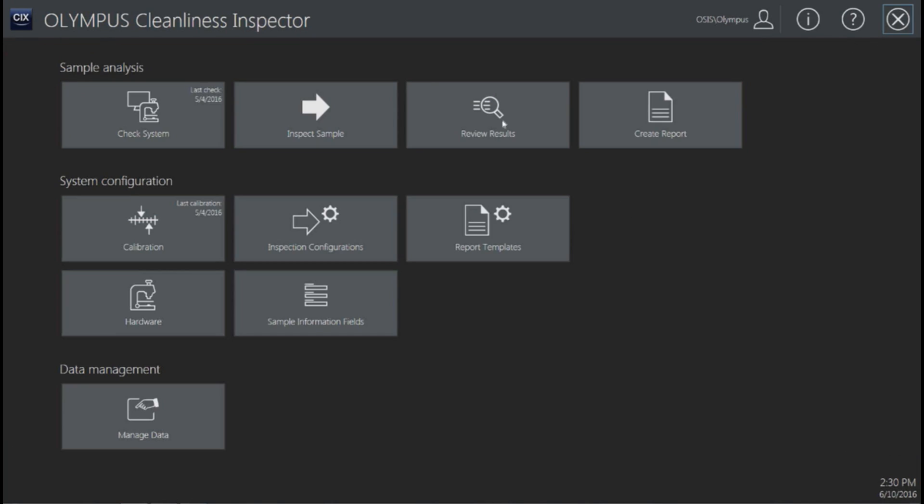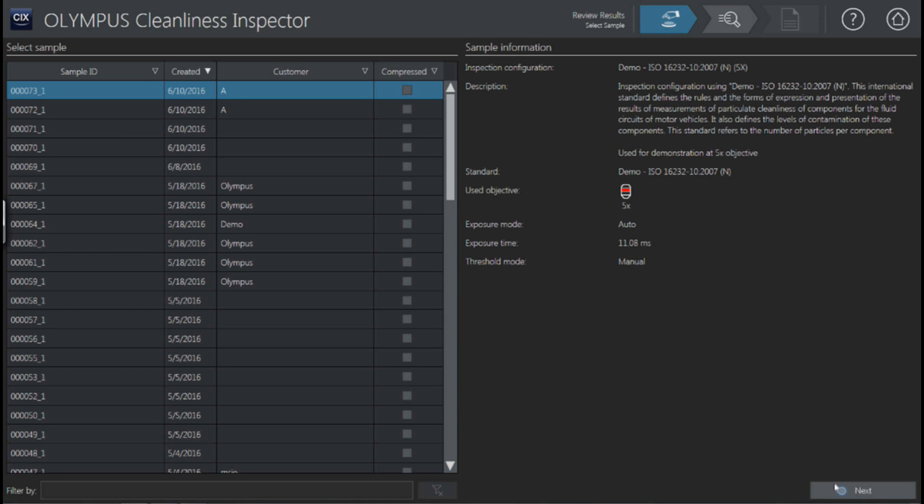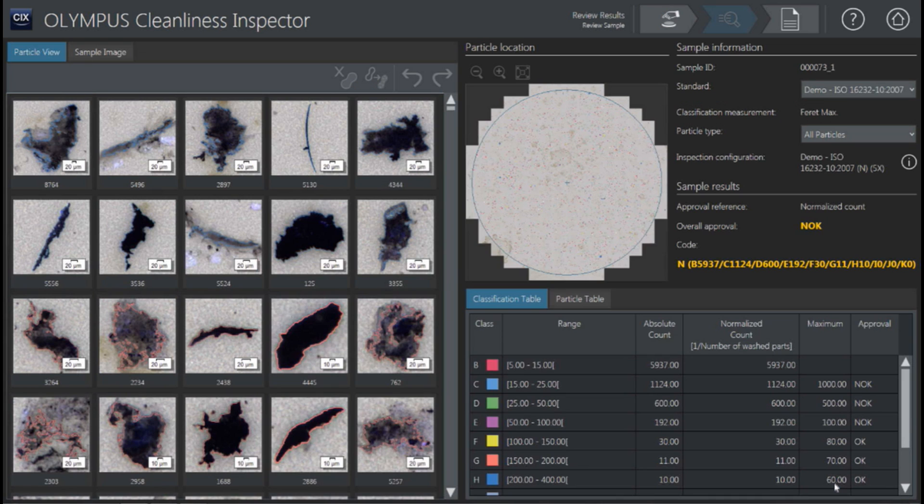Automatically, the report is saved into the data pool of the software. Going back to the software, you can see that later on, qualifying all this data is very important. If a part failed in the field, you could go back, look up that serial number, and pull up all the results again — view results, go in and select them, and it brings up all those pictures again. You can also open the report. Everything is automatically saved and archived in the software, so there's no user who has to remember to save anything — the data is always there as soon as the scan completes.